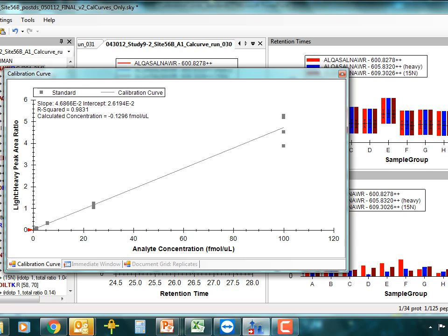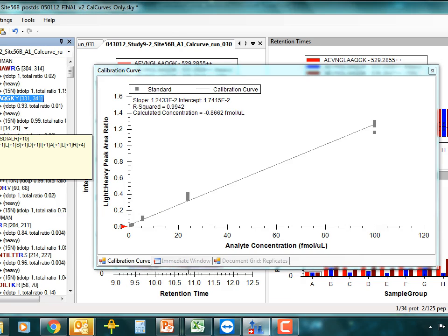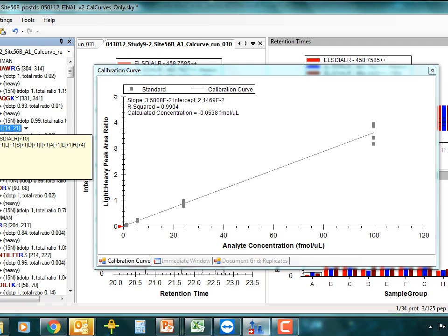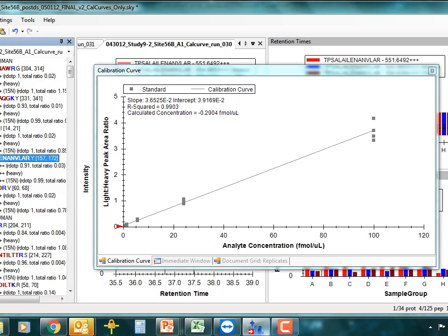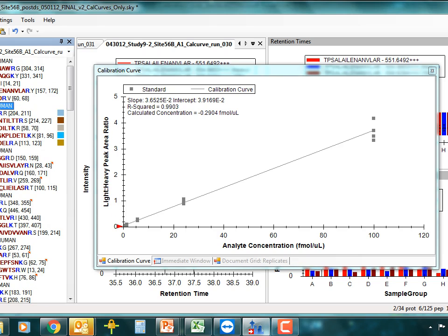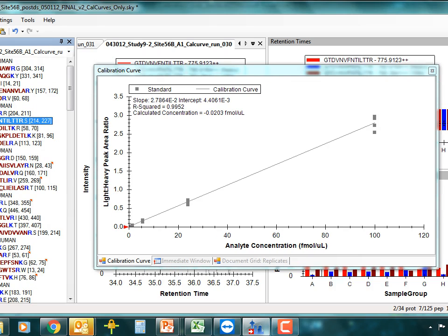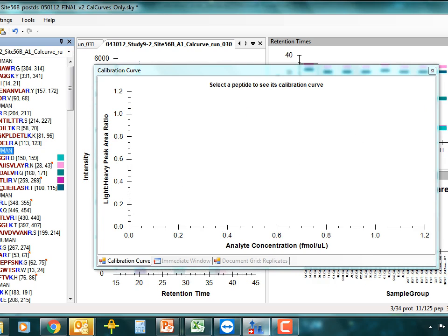But for right now, we have a response curve. I have the first peptide clicked. If I go to any other peptide, it will change the response curve because the peptide response changes, right? So that makes sense and pretty good. And so if you go edit, collapse all precursors, edit, collapse all peptides, then you can just simply use the arrow button and just look at all of your curves as you walk down. So it's kind of interesting to explore that way.